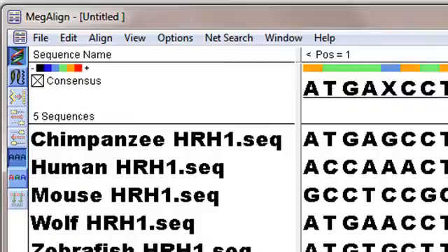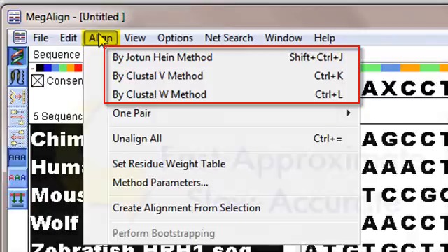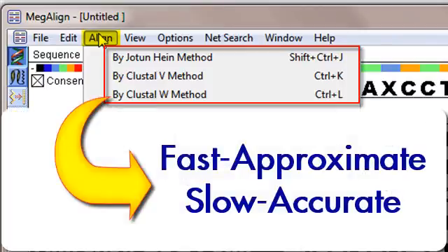MegAlign provides four multiple sequence alignment methods, which are available for all sequence types and for any number of sequences. These are the Jotun Hein and the Clustal-V methods, and two different varieties of the Clustal-W method: Fast Approximate and Slow Accurate.